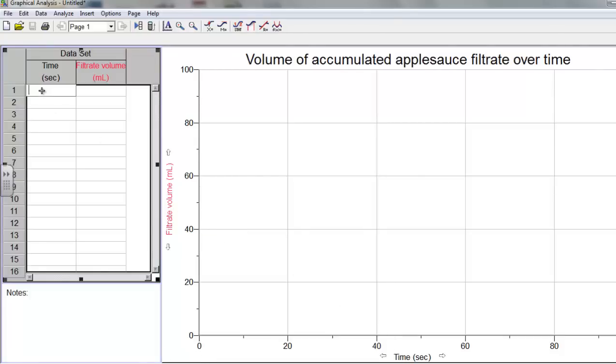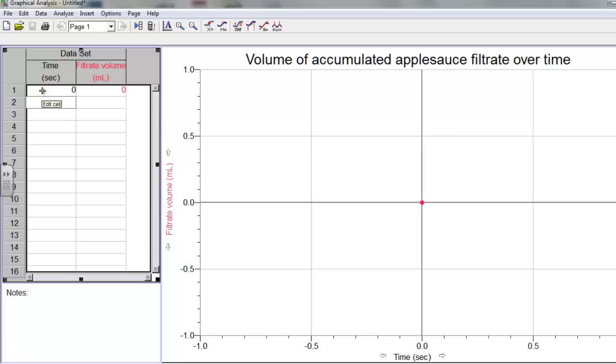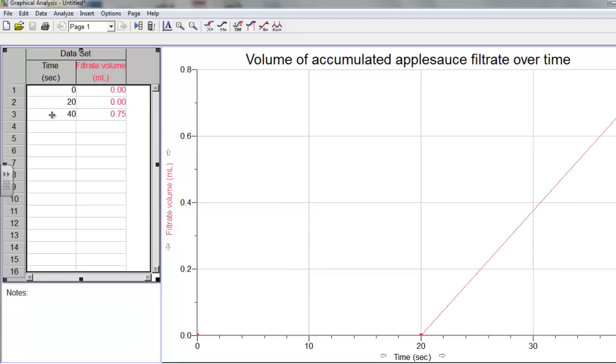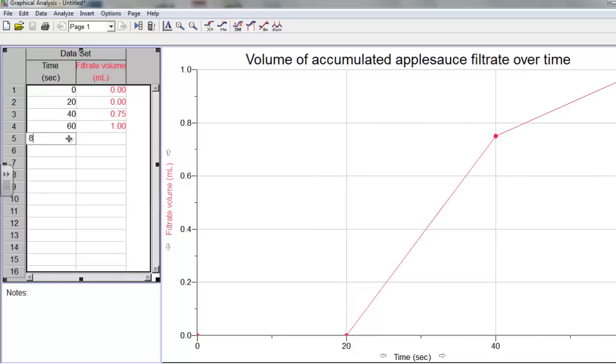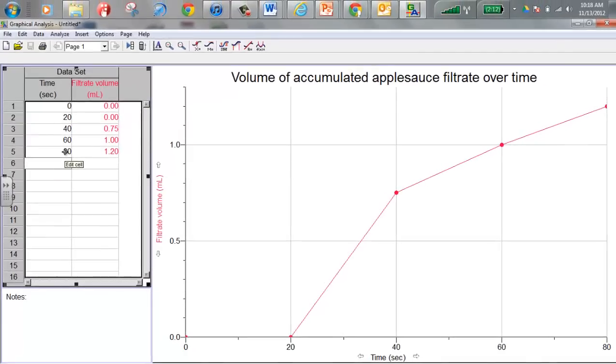What I'm going to do is just start typing in numbers that these guys have. Zero, zero - at time zero you had zero milliliters, that makes sense. After 20 seconds you still had zero milliliters. After 40 seconds you had 0.75 milliliters. After 60 seconds you had 1 milliliter. After 80 seconds we had 1.2 milliliters. And I can keep going but I'm not going to. I'll do one more here - 100 seconds, 1.5 milliliters.